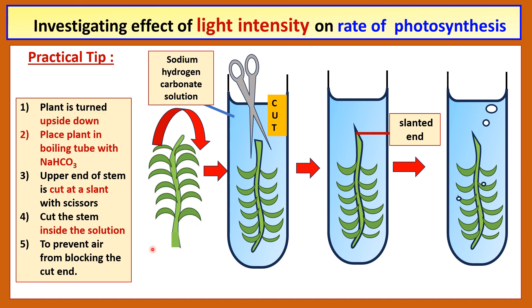This is to prevent air from outside from blocking the cut and the vessels, which would block the oxygen produced inside from coming up. We cut it in a slanted fashion, and this is to increase the surface area so that bigger bubbles may be produced. You can see the bubbles being produced and slowly popping up from the stem, emerging from the stem and floating upwards. Count how many bubbles are released in one minute, two minutes, or five minutes, depending on the question.